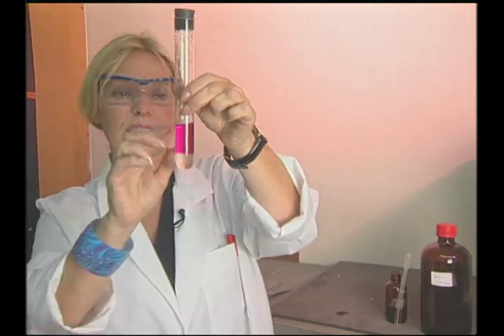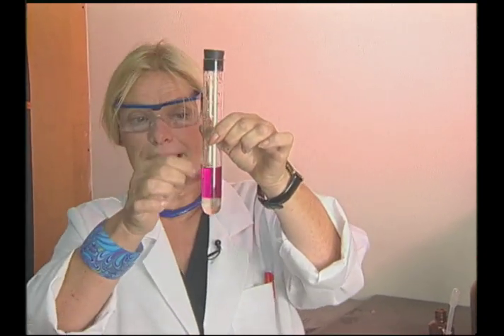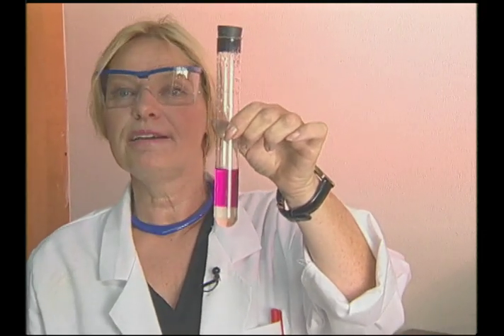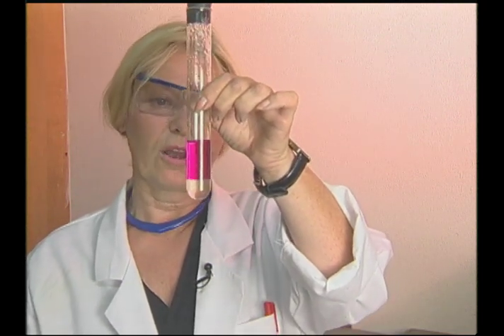Now I could use this further and use what we call a separatory funnel and isolate or pipette off the top layer here, and then let the solvent evaporate, and then I would have the iodine back in its crystalline solid form.